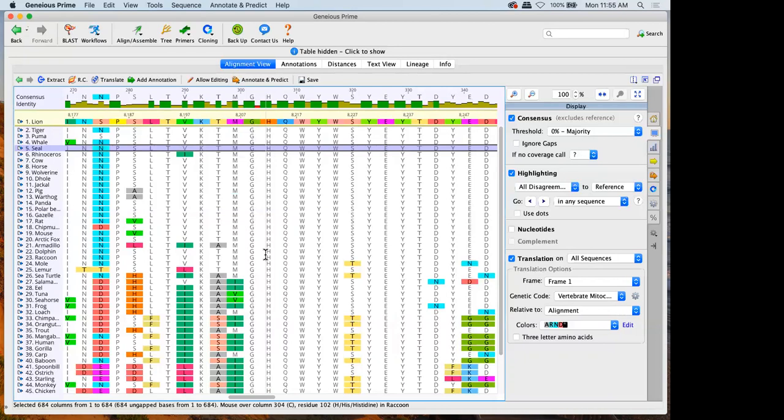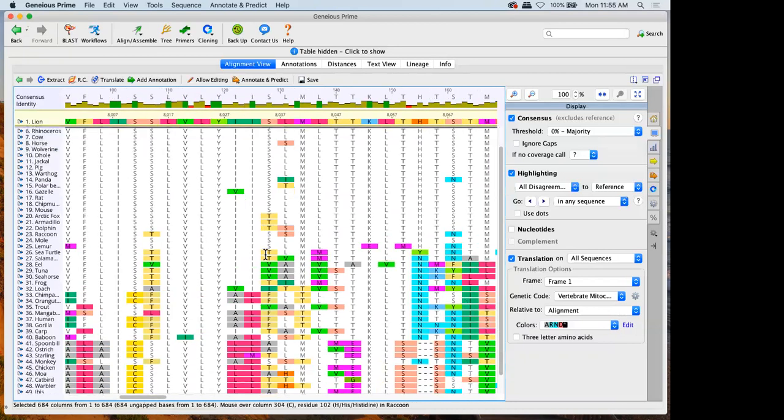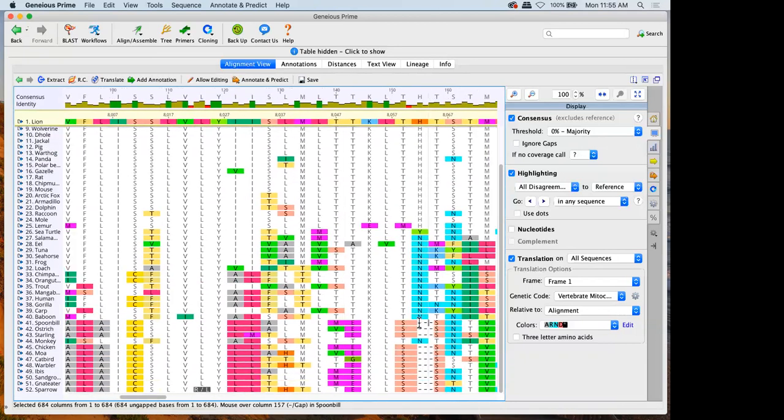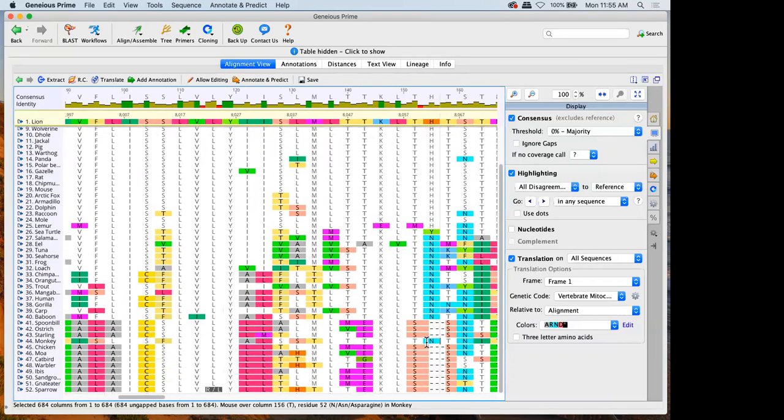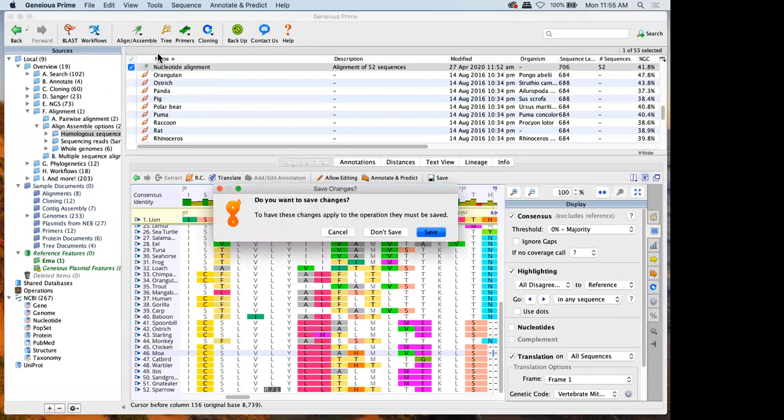Now, one thing to be aware of here is this is still a DNA alignment. I aligned it as DNA sequences, which means it hasn't necessarily put gaps in the best of places. So the gaps aren't necessarily in groups of 3. They might be in the middle of codons. So if we scroll down here, is a good example. So these gaps aren't necessarily in places that make sense. So if you are working with coding sequences or protein sequences, I can realign these sequences.